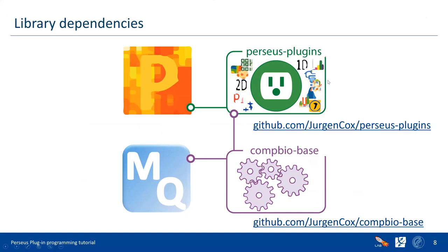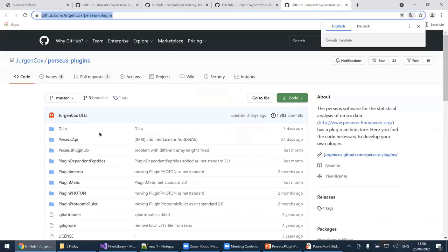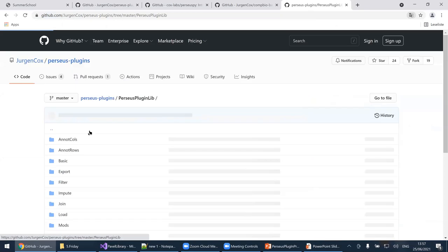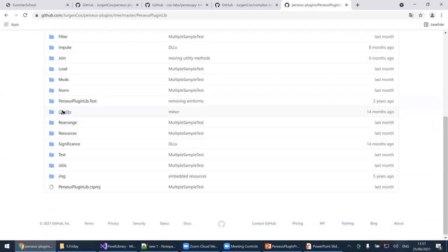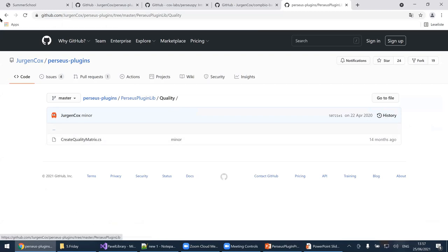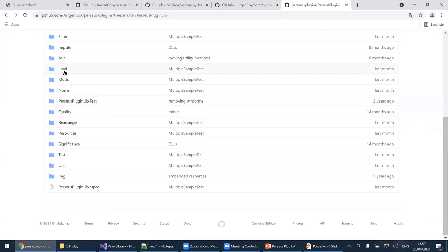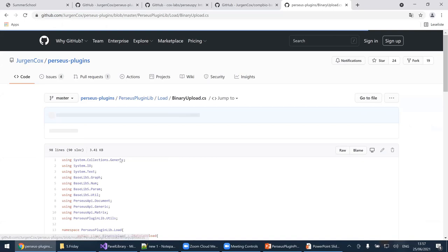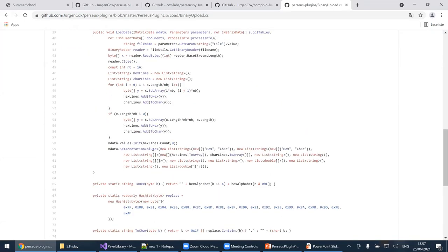Additionally, Perseus is constructed on a plugin infrastructure, and most of the Perseus plugin infrastructure is deposited on GitHub. You can go there and read how plugin functions work. You can go to Perseus plugin lib and check a lot of activities we use — for example, create quality matrix. You can open the file and see the actual code that is working in Perseus right now.